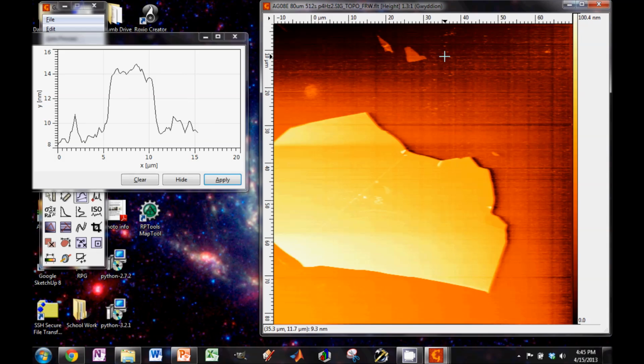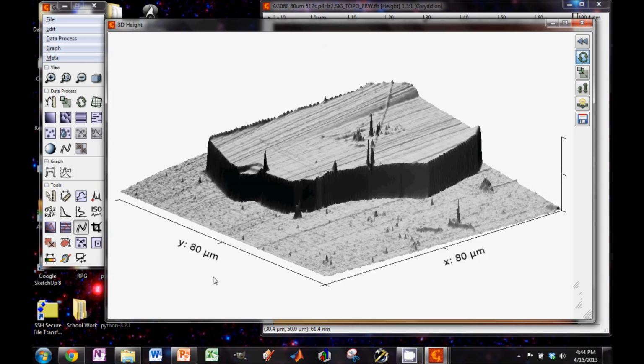Now there are many more features I haven't touched on, but I'm trying to make this a brief video, so I'll end here. Once you start gathering your own data, I strongly encourage you to play around with the software.